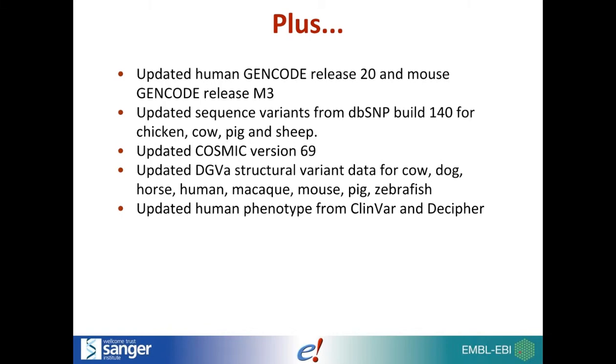A few other things that have come out. We've updated our gene builds for human and mouse. So for human, we now have GENCODE release 20, and for mouse, GENCODE release M3.